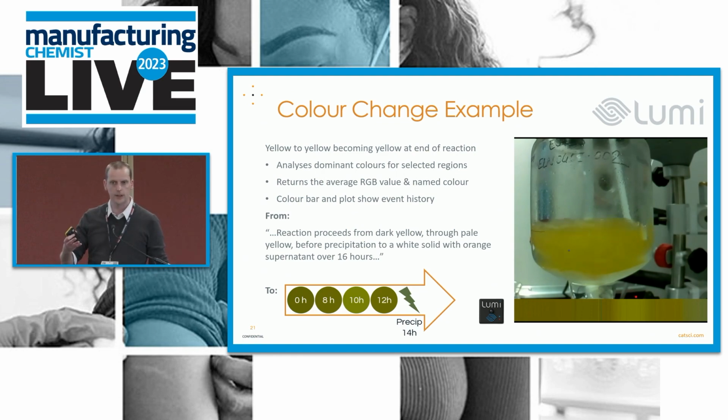So at this time, it was this color, these kind of visible properties, and then proceed through the lifetime of the reaction until, in this case, there's a precipitation, and you can start to describe what that looks like as well.